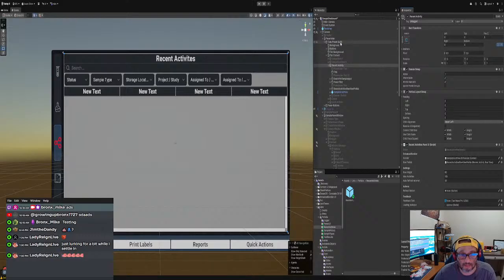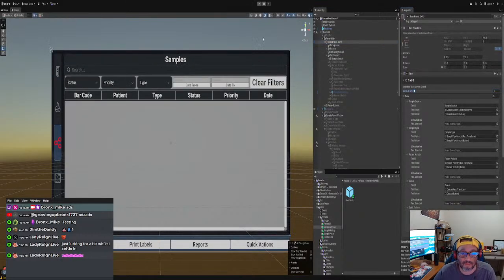All right. I like to start from the very beginning, so I'm gonna just change it from here.